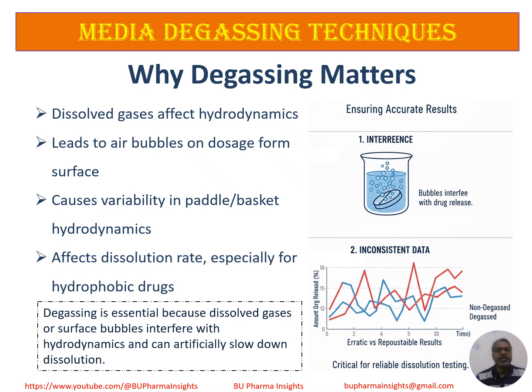This leads to variability in paddle or basket hydrodynamics, inconsistent results, and artificially slower dissolution, especially for hydrophobic drugs. That's why USP 711 specifically highlights the impact of dissolved gases in dissolution testing. In short, poor degassing can compromise accuracy even when the method looks correct.